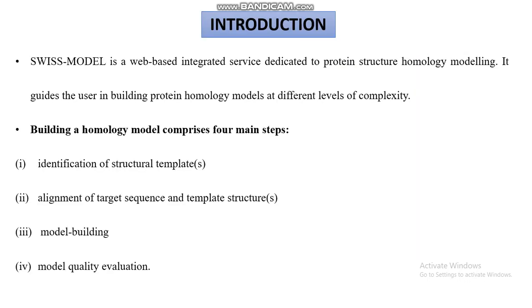Swiss Model Server is a web-based integrated service used for protein structure homology modeling. It guides the user in building protein homology models at different levels of complexity.